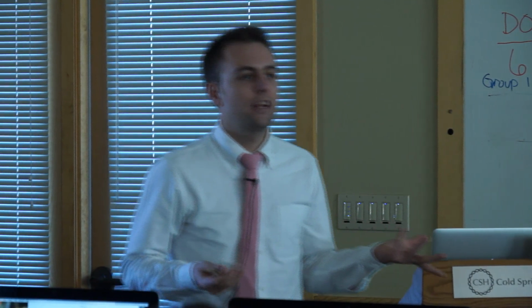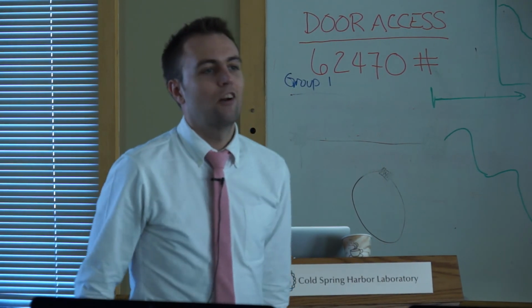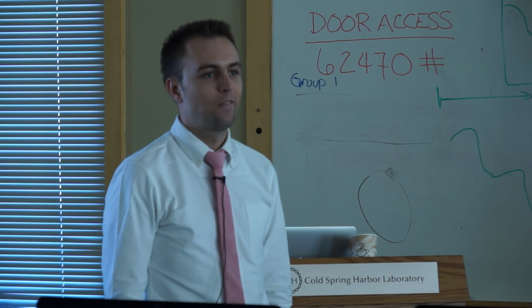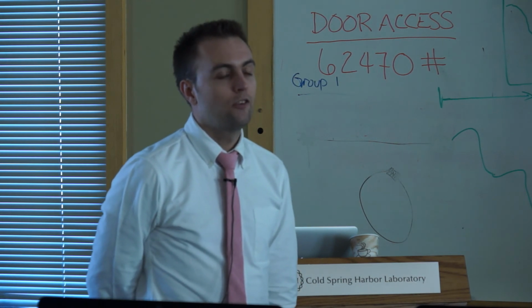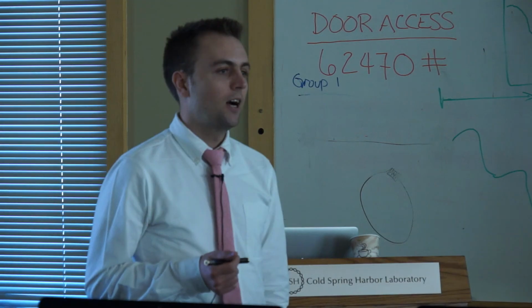So what's after aligning? Someone mentioned it before. Now all our reads are aligned. We get BAM files or whatever. Yeah, peaks. So in a lot of ways, ATAC-seq is similar to ChIP-seq data. We make a few hacks in a way to MACS2 to call peaks.